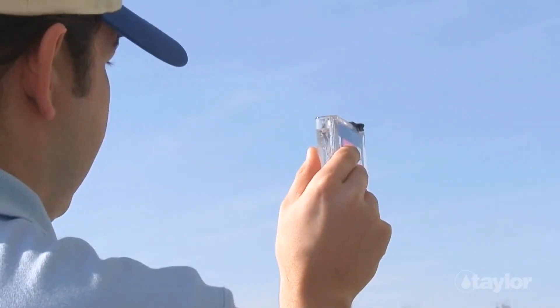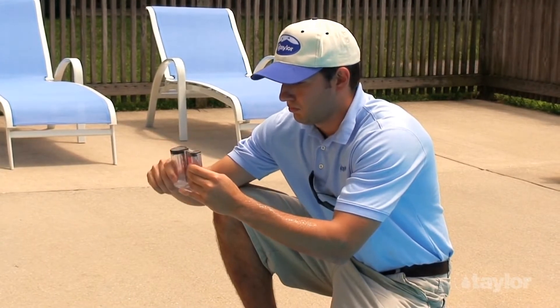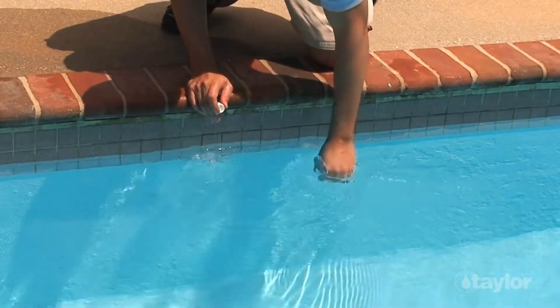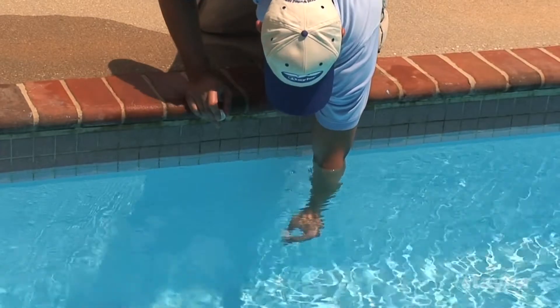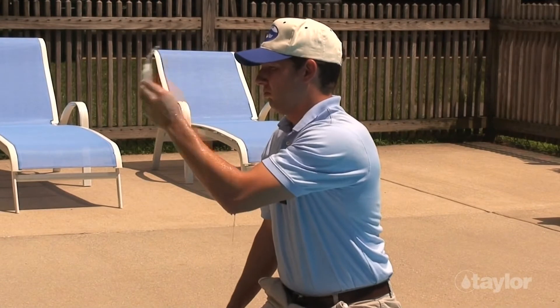Flick off excess water with a quick motion of your wrist until the meniscus rests on the marked fill line. Begin the test. When instructed to fill the number 9191 cyanuric acid dispensing bottle, or the number 9198 graduated sample tube, or any other test tube or test cell on your Taylor kit, follow the same procedure.